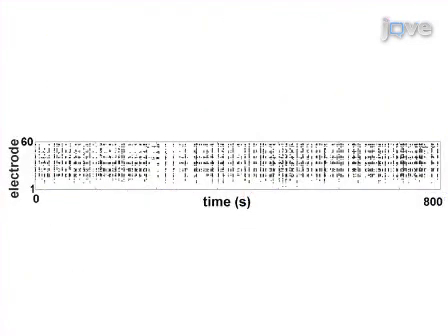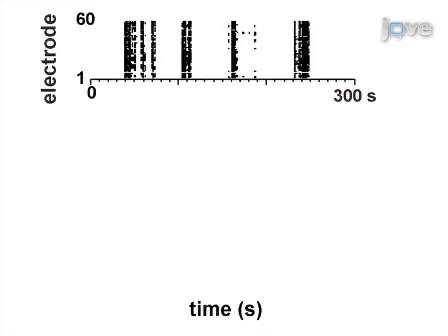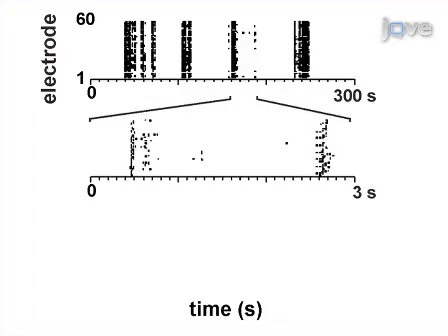When extracting NLFP peaks that cross a threshold of multiple negative SD, the activity in the form of NLFP peak times is conveniently visualized in a raster in which columns of dots represent near-coincident NLFPs at various electrodes. The spatiotemporal organization of this activity is rather complex. Columns, which appear more or less homogeneous at low temporal resolution, are composed of separate clusters at higher temporal resolution, and so on.